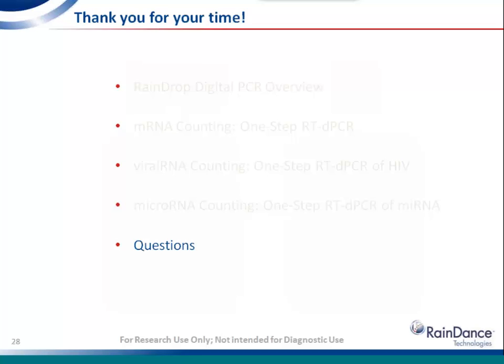The droplet size is precisely measured and is maintained from the beginning of the run to the end of the run using feedback control. So you can generate anywhere from 5 million droplets to 10 million droplets.